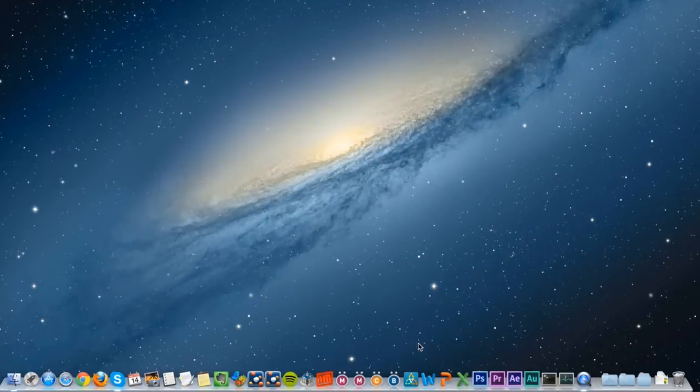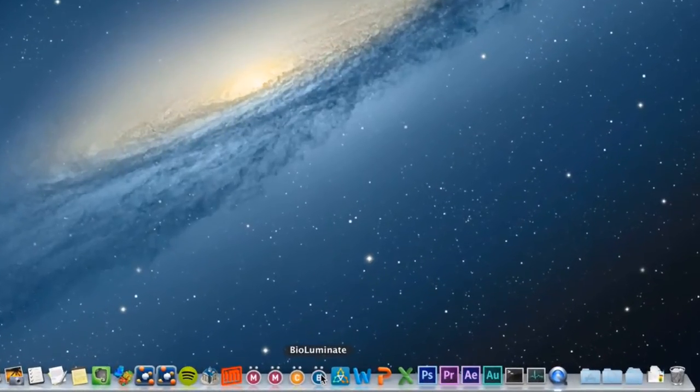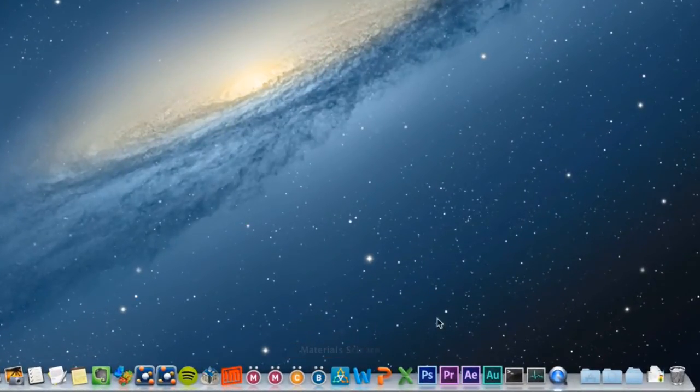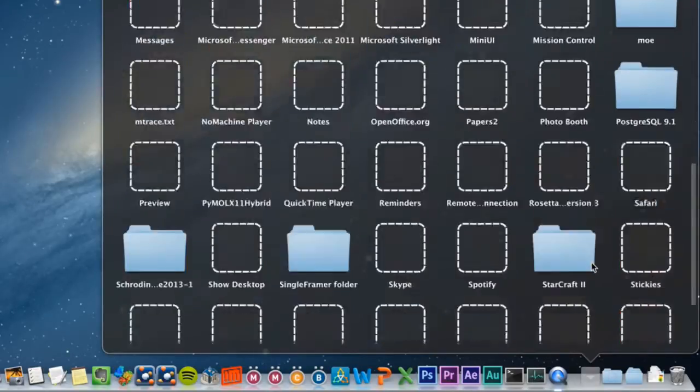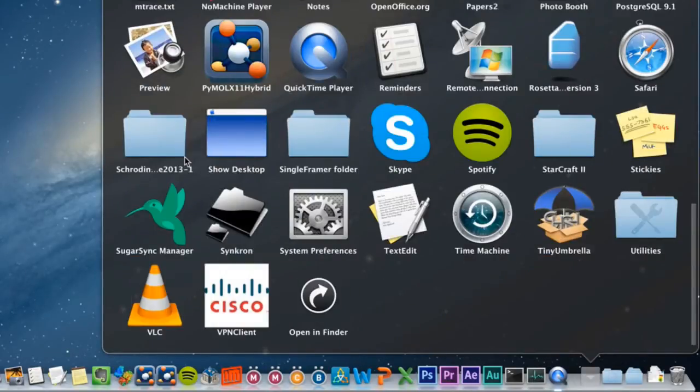To start BioLuminate under Mac OS X, click the BioLuminate icon on the dock, or if the icon isn't on the dock, go to Applications and look for it in the Schrodinger folder.